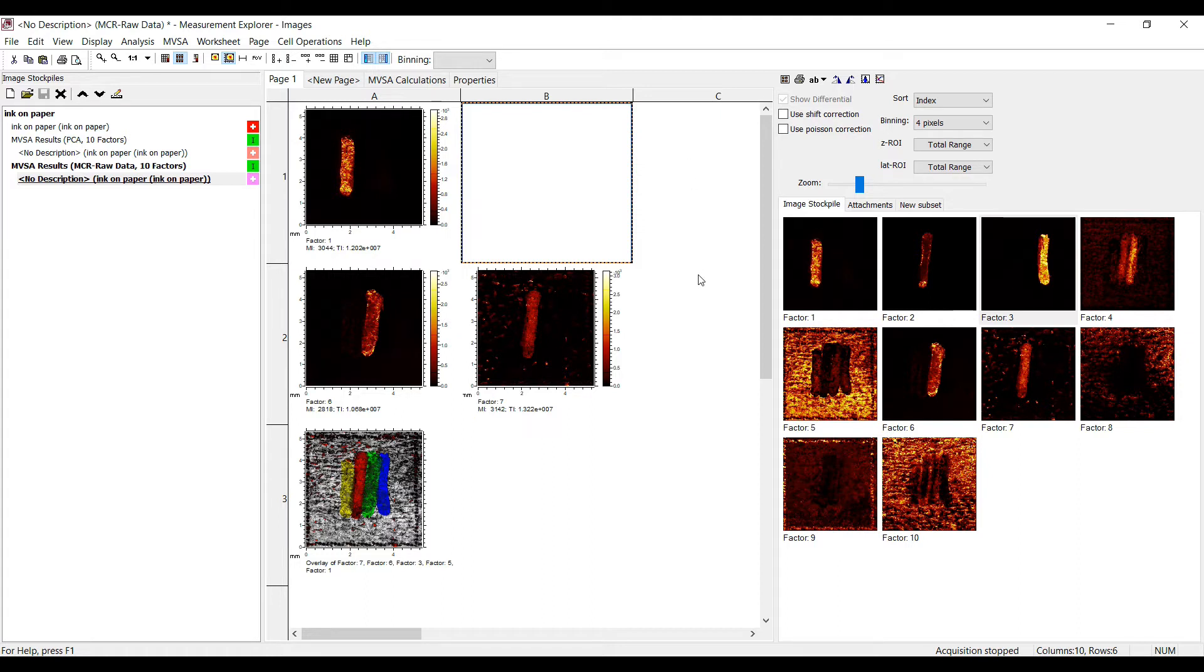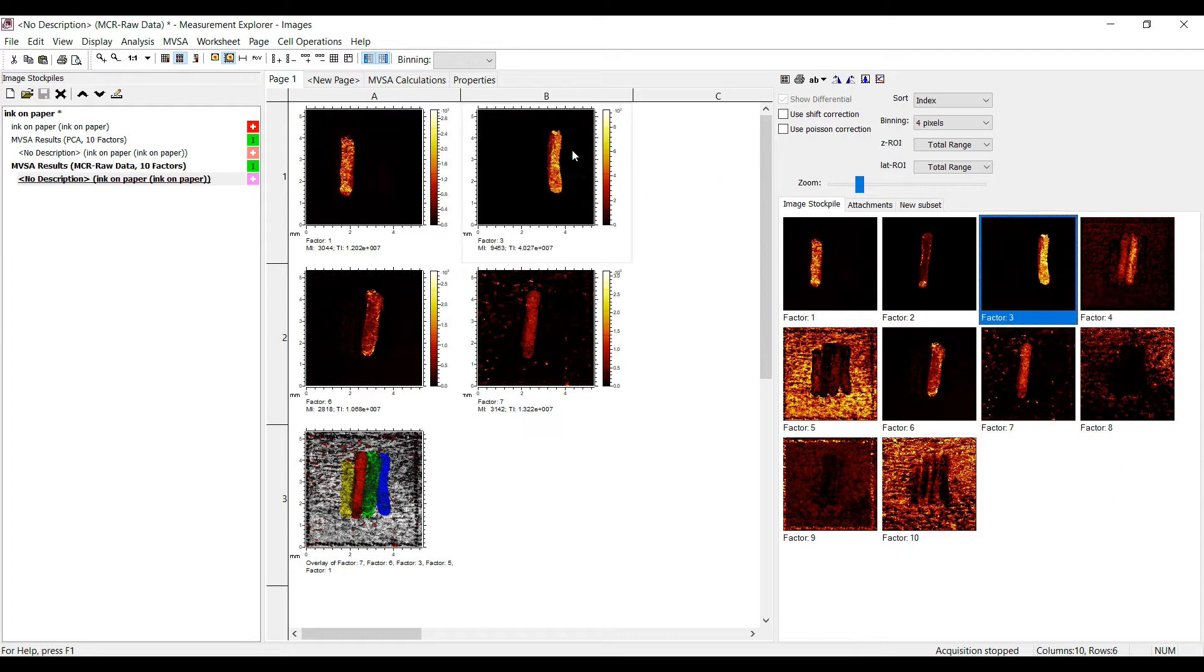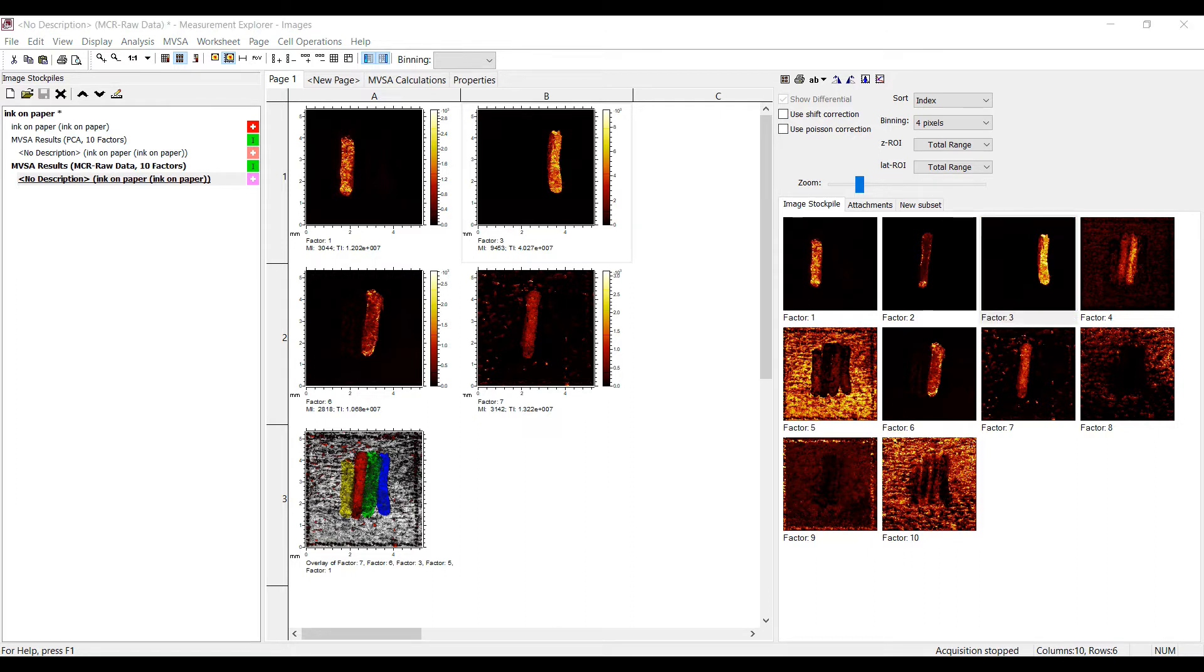In the image program, the score images are given in the image stockpile. They can be added to the worksheet and processed like a standard image resulting from a mass interval. The score images describe the relationship between the pixels as described by the factors.